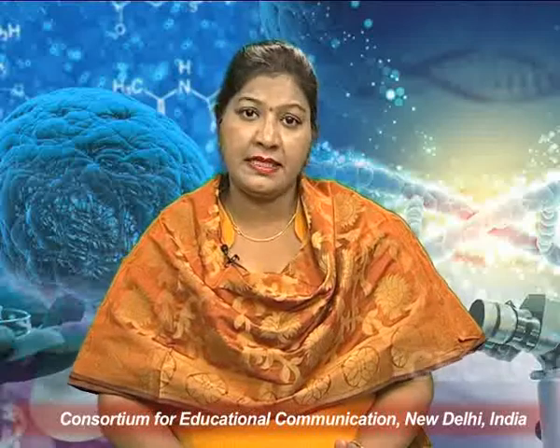This tip is attached with the cantilever, and the cantilever will decide the deflection of the tip, and this tip scans the surface. So this is the basic principle of the AFM: it finds the surface texture as well as the forces between the specimen and the probe. That is also known as the microforce sensor.